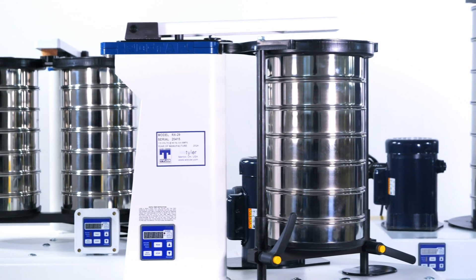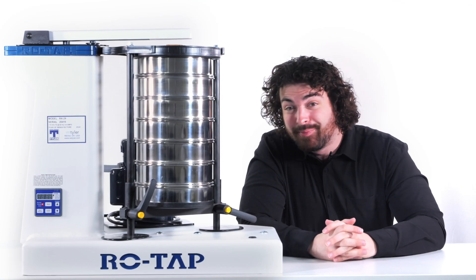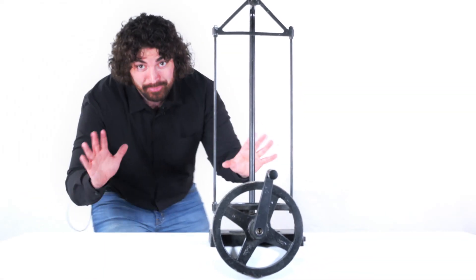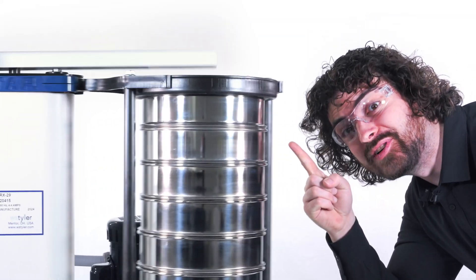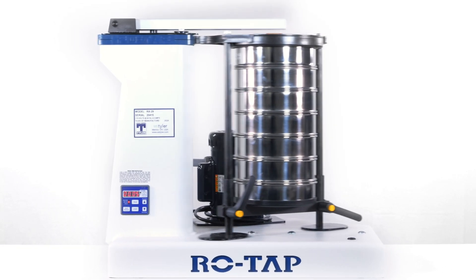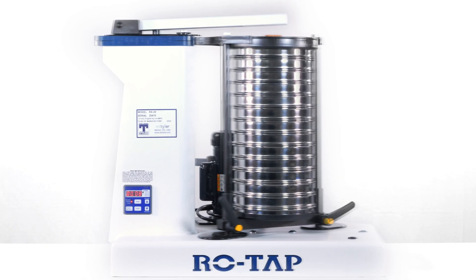Each of these Ro-Tap models is made slightly different to fit your specific particle size analysis needs. The RX29 has basically been the industry standard since we invented it back in 1914. It was updated and upgraded since then, but the idea is still the same. It creates a dual oscillating motion and uses a brute force hammer tap to separate particles into their individual sizes. The RX29 uses 8-inch test sieves and you can fit up to 6 full height sieves plus a collection pan, or 13 half height sieves plus a half height collection pan.